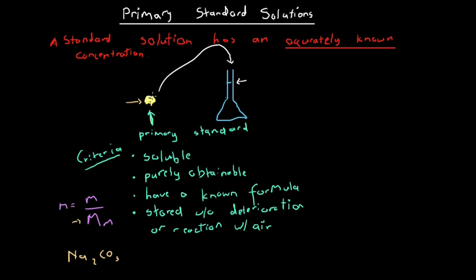Now another one that we can kind of throw in here. It's not as crucial, but it is kind of true. It's not a criteria, but it's a useful property, I guess, of a primary standard for it to have a high molar mass.